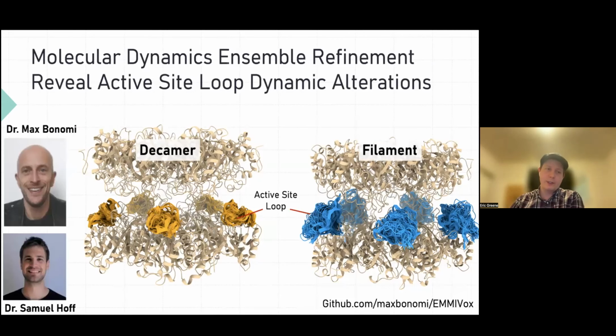And so we turned to some friends of the Institut Pasteur, Max Bonomi and his talented postdoc Sam Hoff, and we did molecular dynamics ensemble refinement into these different maps. So how this works is it's both the molecular dynamics simulation, so it takes in physiochemical force fields, but then it also takes in information from the cryo-EM map itself to guide the refinement.